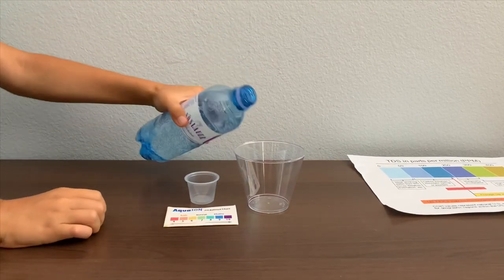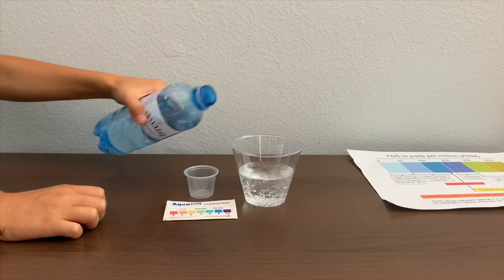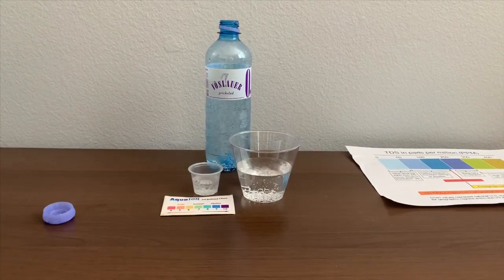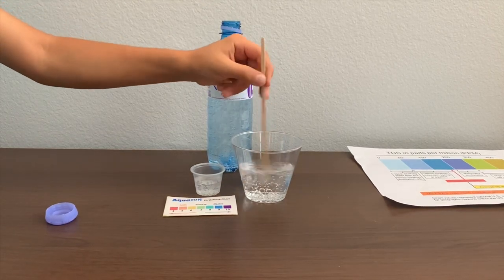Let's pour some water in. First, we're going to test the TDS level, but first let's stir it a little for a better result.